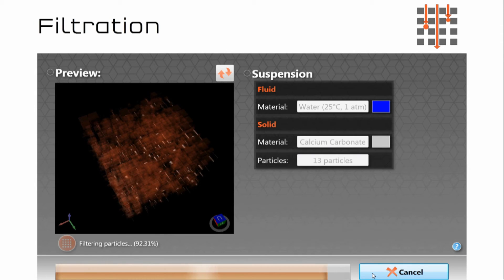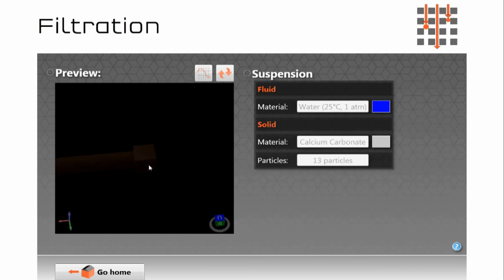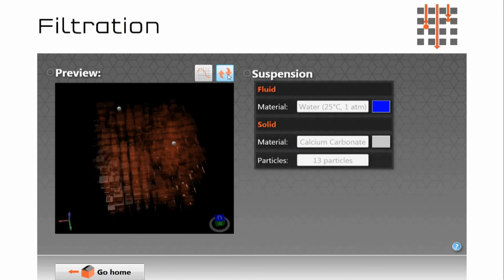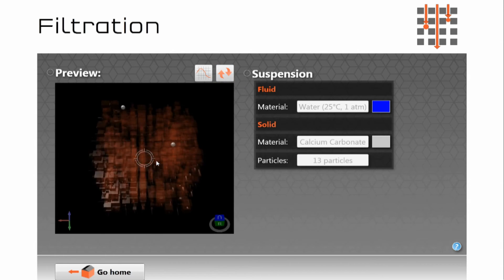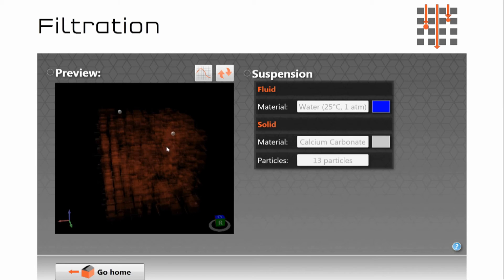Okay so now we see the filtration simulation coming to its end and then we click on the filtration button here, refresh it and here we see the structure and the two large particles as you can see have been trapped right at the top of the sample. Other particles may be trapped inside it.